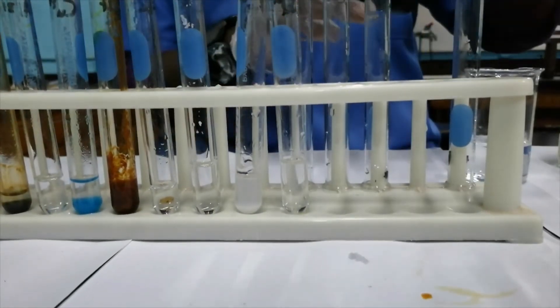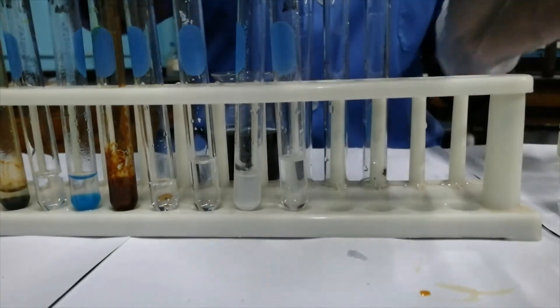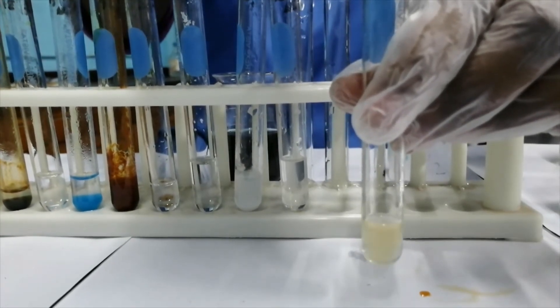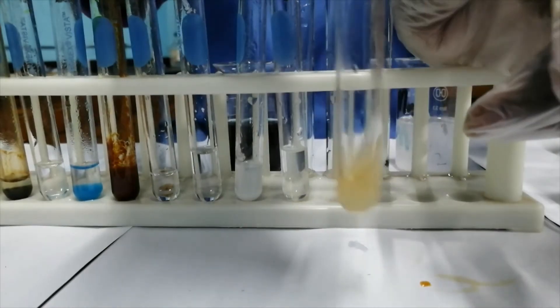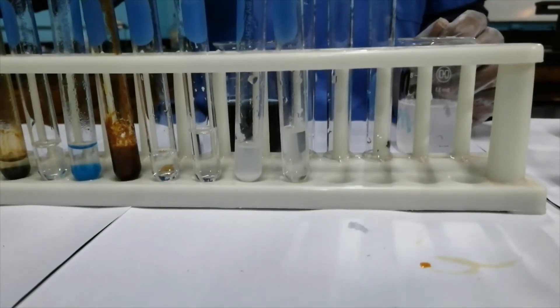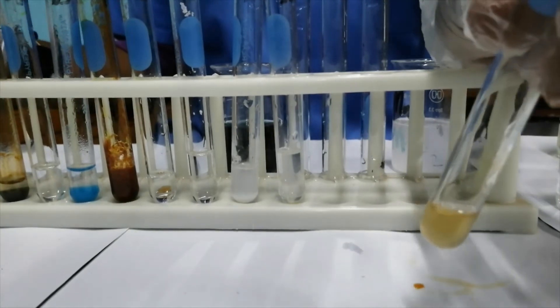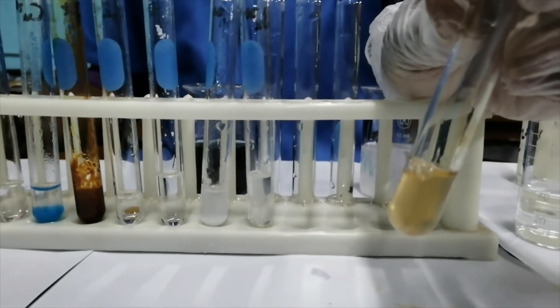Let's look at the manganese and chromium ions. In terms of the manganese ion, Mn²⁺, it's actually a pale pink solution. On addition of sodium hydroxide, a precipitate forms — you decide what color you're seeing. I'll pour out the excess solution and add more aqueous sodium hydroxide. What is it that you're seeing — a precipitate or a solution?